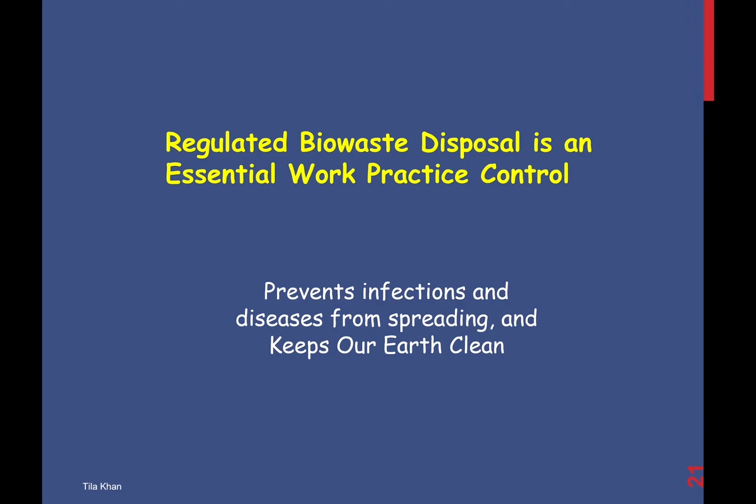Regulated biowaste disposal is an essential work practice control. This means that this practice of regulated waste disposal reduces the risk of exposure by altering the way in which it is performed to make it safer. Overall, regulated biowaste disposal prevents infections and diseases from spreading and keeps our earth clean.